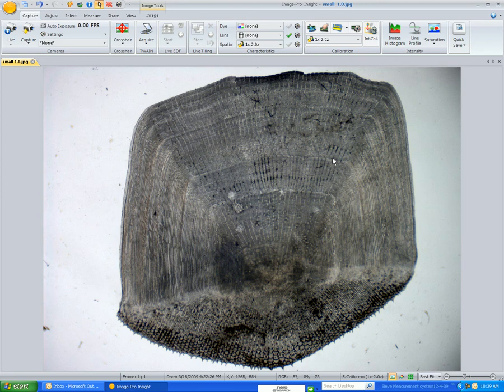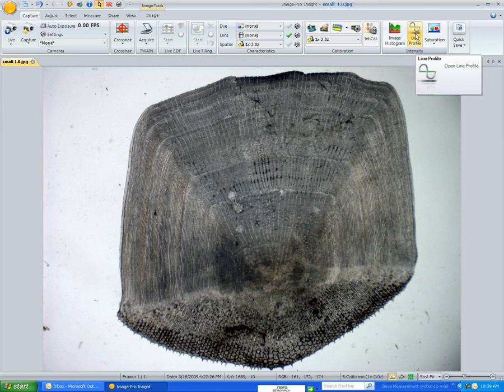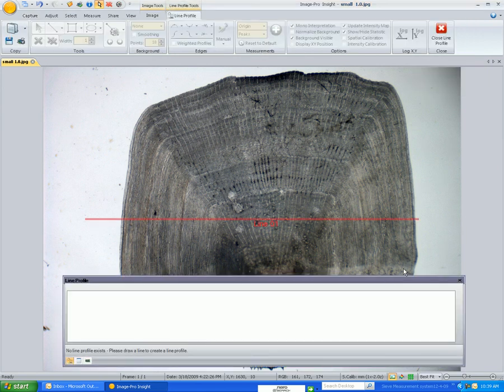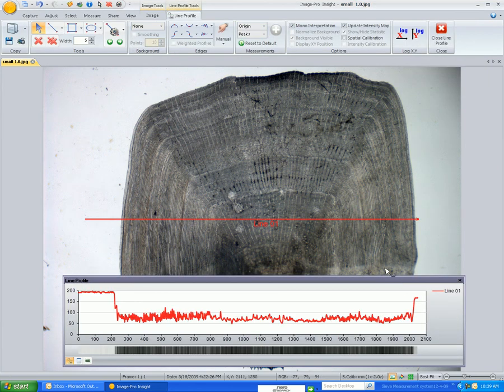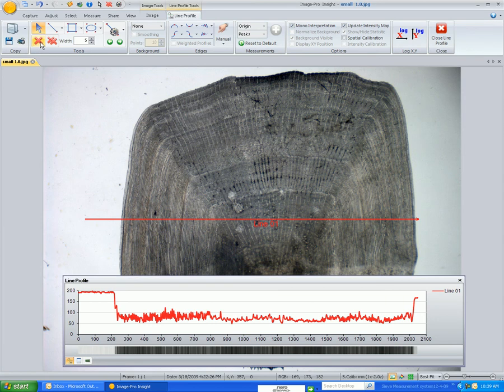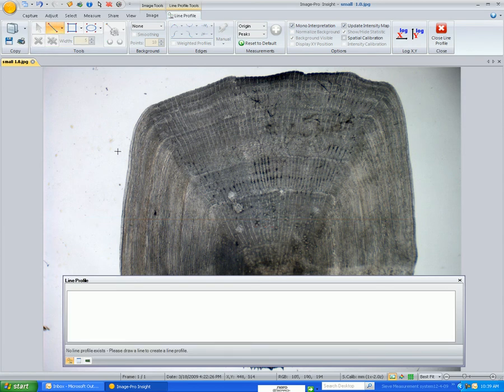Now what we want to do is measure. We want to get what's called a line profile. So I click on the line profile icon — it brings up an initial line and I'm going to delete that.